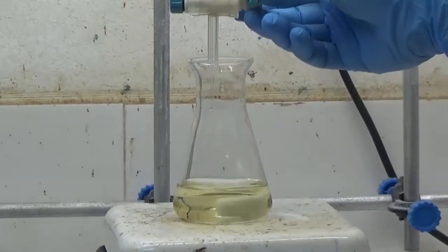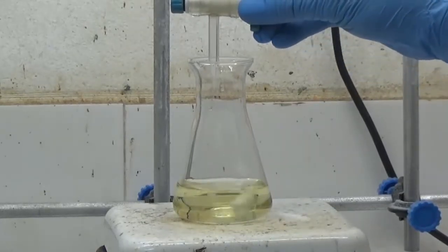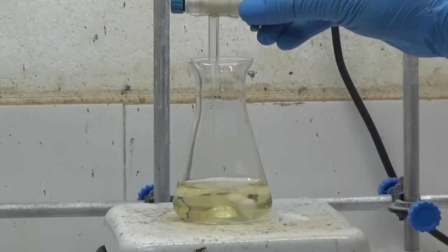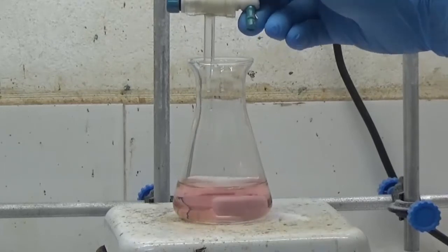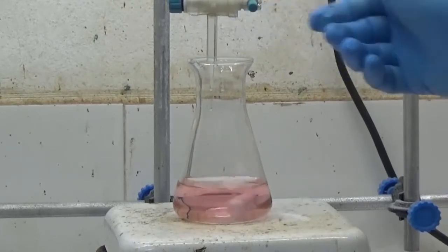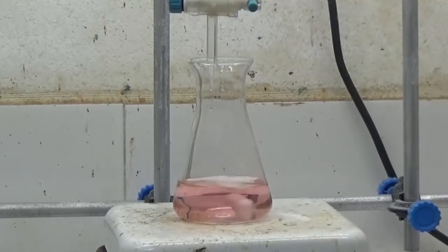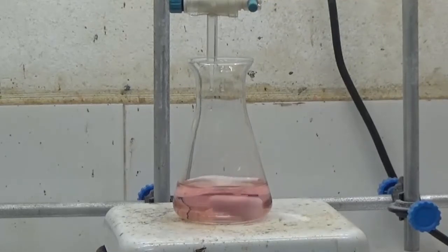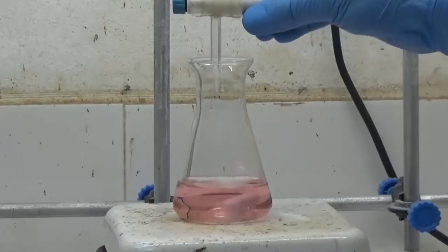That's a yellow solution. Put 25 ml of 0.01 molar hydrochloric acid solution in a burette and drop the acid solution with stirring on the sodium hydroxide solution until it changes color. It's a red solution. The pH of the solution changed between alkali and acid.